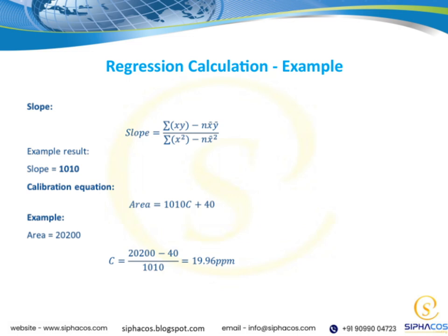First, we start by identifying our data points and the variables we're analyzing. Next, we use these data points to compute the regression coefficients, which essentially tell us how much our dependent variable is expected to change with a unit change in the independent variable. This process involves some calculations, like finding the slope and intercept, that are fundamental to understanding the relationship between variables.